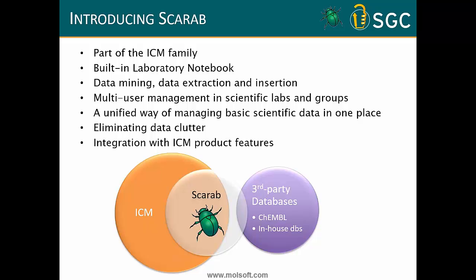So Scarab is actually part of the ICM family. So those of you who know ICM will not be surprised to hear that this is something that is integrated within the ICM platform itself. It's not a separate program, although it can be run in a standalone mode if you so desire. It features a built-in laboratory notebook, a very generic laboratory notebook, which I'll show you, and also data mining, extraction, and insertion capabilities, some of which are quite unique and quite powerful, as if there is time I will show you.